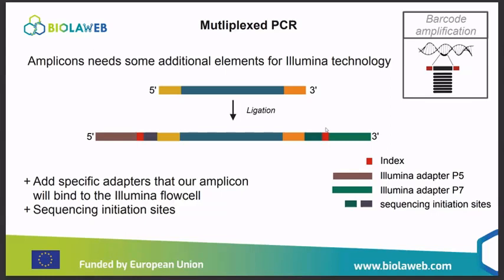And when you have all these sequences together, then you will select, filter your samples by these index sequences and say, okay, all these have the same index sequences, so we know they belong to this sample, and all these others have another sequence, and that's what we call the multiplexing.